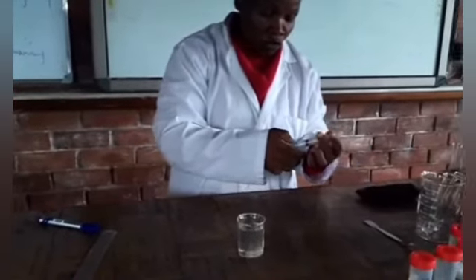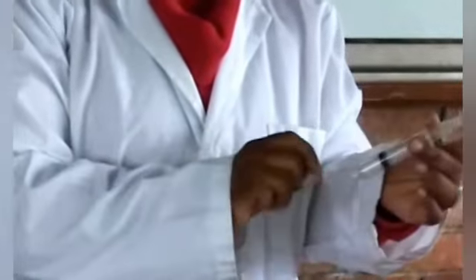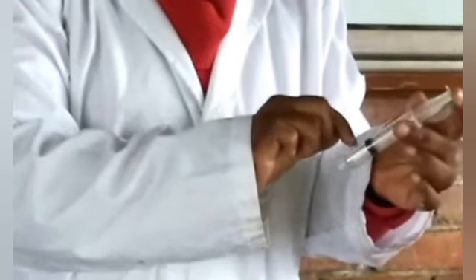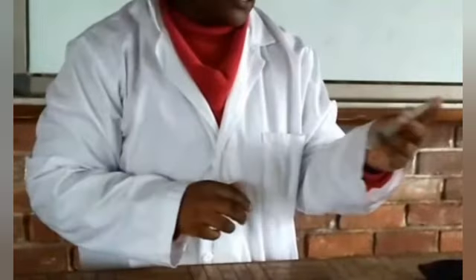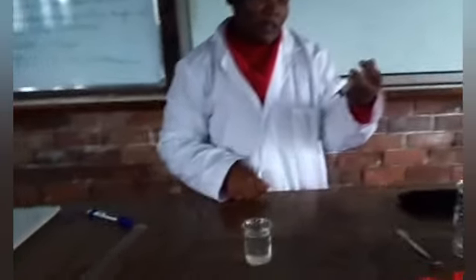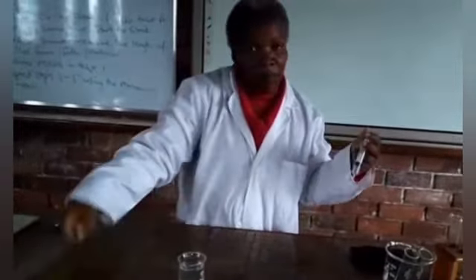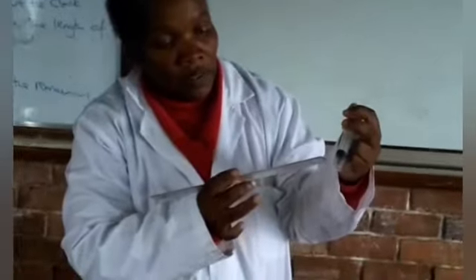So my syringe is starting from 0, 1, 2, and in between we have a line. So it's like 1, 1,5, 2, 2,5, 3, 3,5. Basically, this is how it reads. So if a value comes in between two lines, then it will be 0,25. If it comes in between, for example, and this is our 0,5 mark, anywhere in between the two lines, then it will be reading 0,25. So with the syringe, our volume is going to be recorded correct to 2 decimal places.